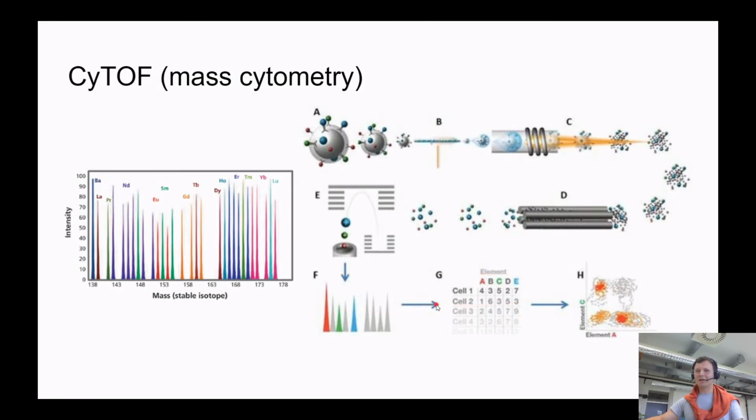So, how can we use that? As you may imagine, of course, this method really favors measurement of the concentration of membrane proteins, proteins on the surface. And that's actually true, like most of the methods doing that. And you can also measure a huge number of single cells. So where is information about surface proteins used a lot? That's, of course, the immune system. In the case of the immune system, just tell me which proteins you have on the surface, and I will tell you who you are.